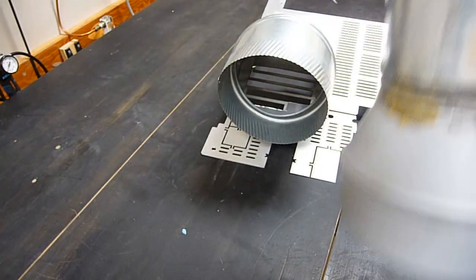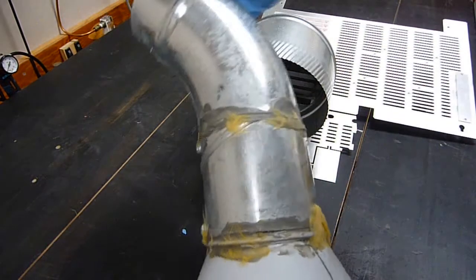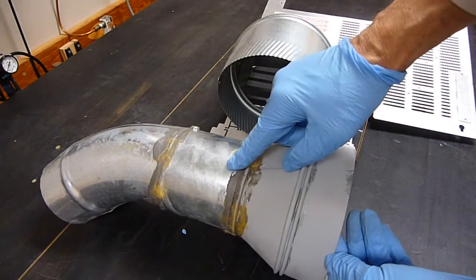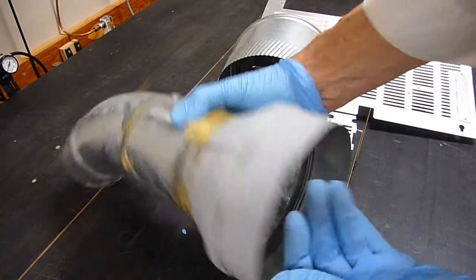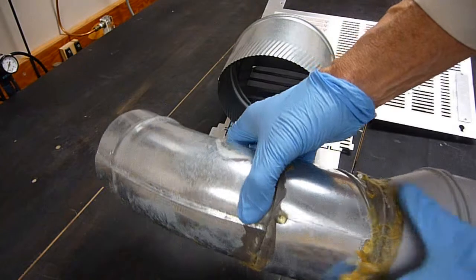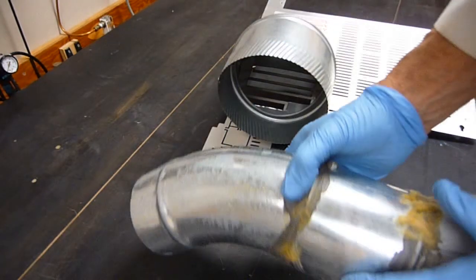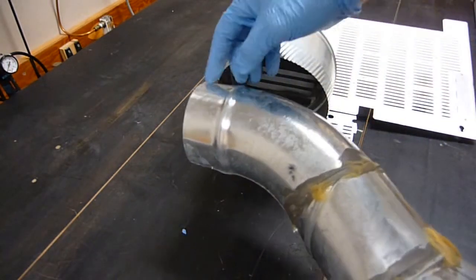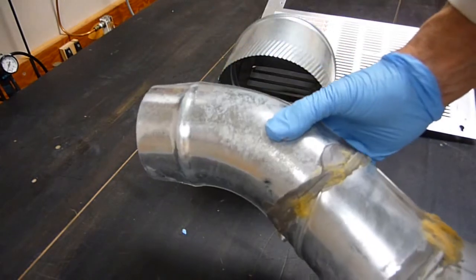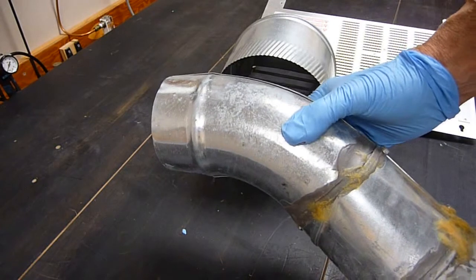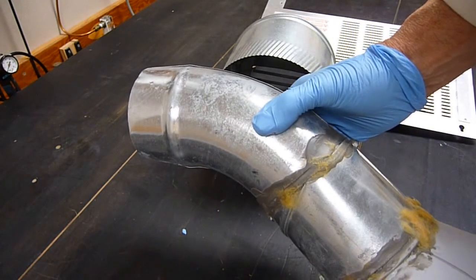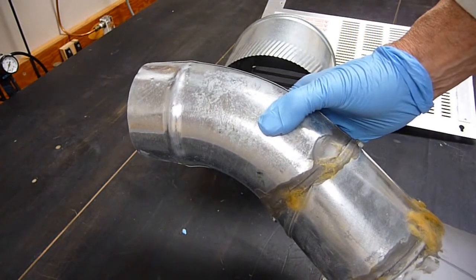And then, this is the six inch to four inch adapter. Also commonly available. Anyone says six by four. And then, this is a four inch 45 degree elbow. Commonly available. And so, you'll see this as we, once we get hooked up again to the HVAC system.